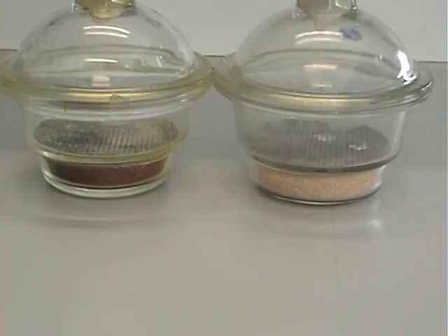For a desiccator to function properly, its desiccant must be fresh. On the left of this image is the bright orange fresh desiccant; on the right is the hydrated used desiccant.